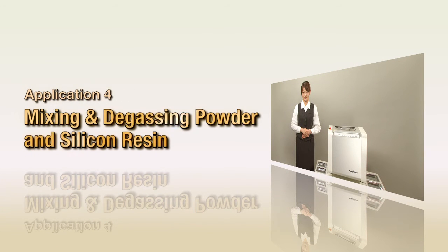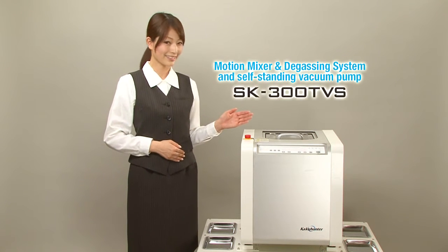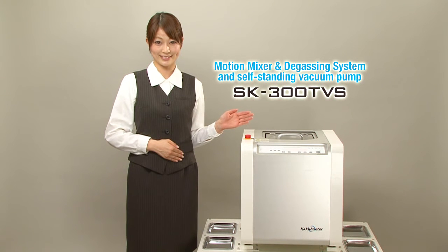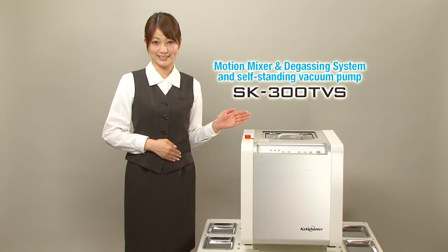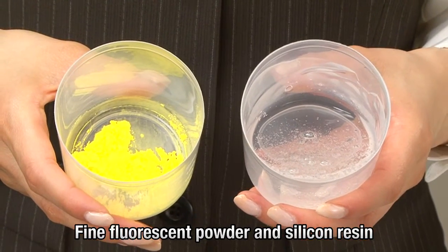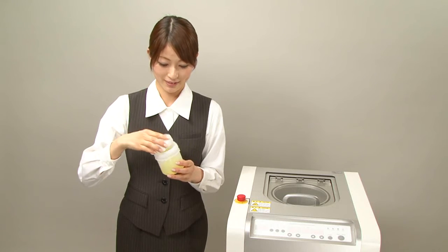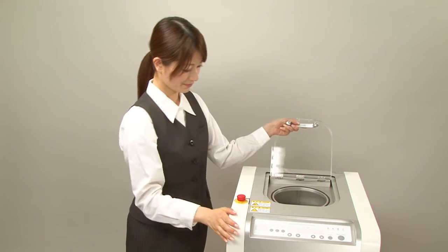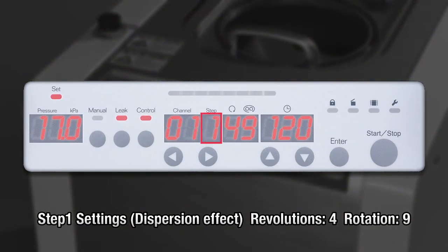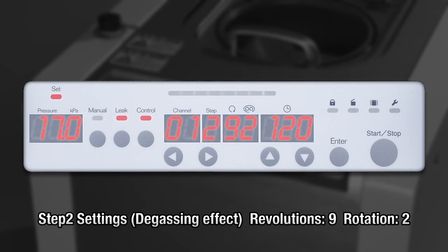Mixing and degassing powder and silicone resin. Here, we will use the SK300TVS with vacuum pump in multiple step operation with depressurization in order to mix powder and resin into a paste and degass the material. The materials are finely ground fluorescent powder and silicone resin of differing specific gravities. The container with the materials is set in the holder and the lid is closed. In step 1, revolutions are set to speed level 4 and rotation to level 9 to create a dispersion effect. Then in step 2, revolutions are raised to level 9 and rotation is lowered to level 2 to promote degassing.